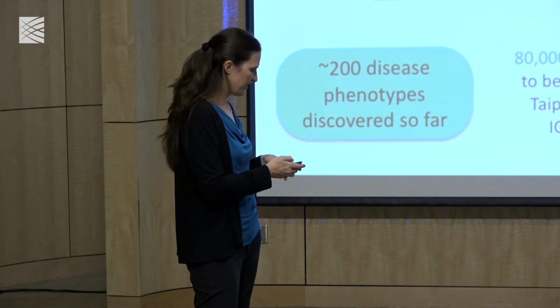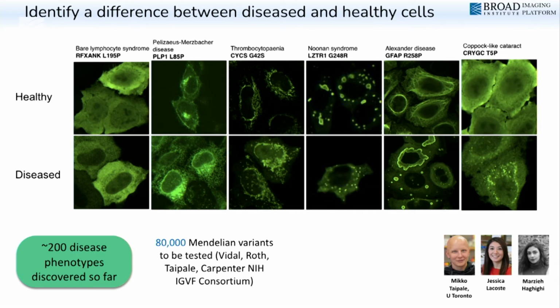And just want to comment on this project that it creates a new bottleneck. When I say, okay, now we have a couple hundred disease phenotypes, we'd like to do a couple hundred drug screens. And so it's a really neat collaboration that I won't show today, with JT Neal and Paul Blaney here, who have a neat barcoding-based optical profiling method that allows us to take cells like this, mix 200 of these different genetic variants together in one well of a dish, treat with a compound, and then just say, does this compound seem to reverse the unhealthy phenotype for any of these 200 disorders at once?